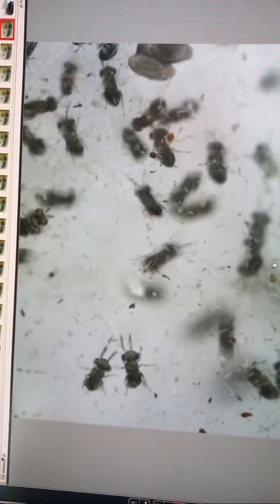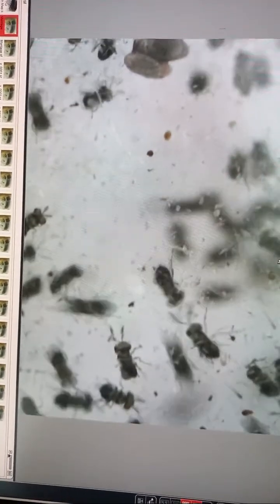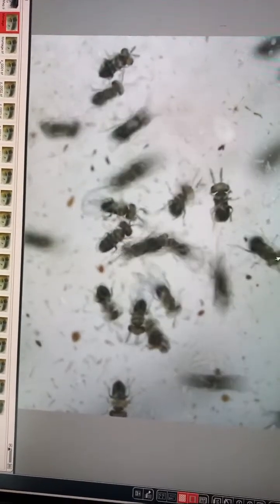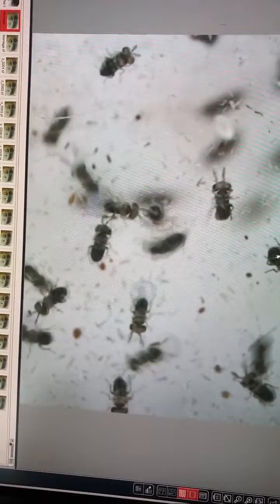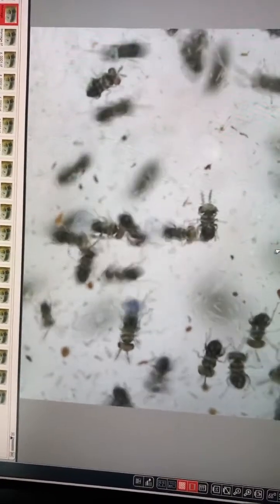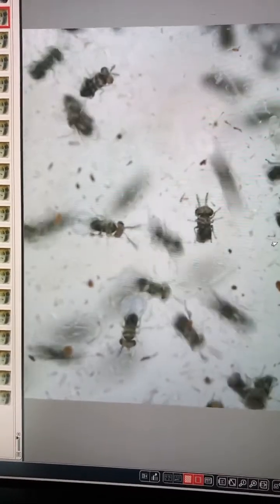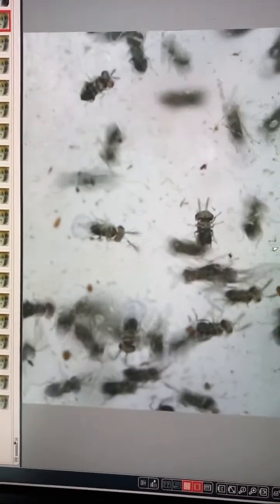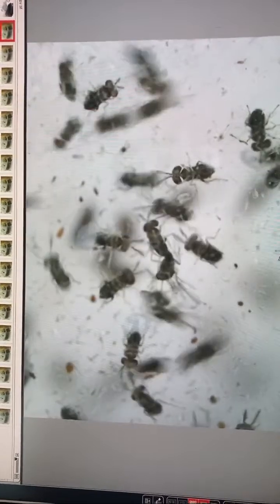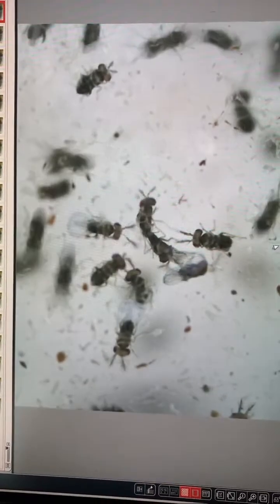This material I received from separate agricultural laboratory, which is sending this material for me for study and for identification. To identify species name of this tiny Trichogramma. Because to identify these insects, it's necessary to make very small microscopic slides on glasses and take very big magnification under the microscope to watch details of morphology. Details of morphology means details of male genitalia, details of antennae, details of wings.